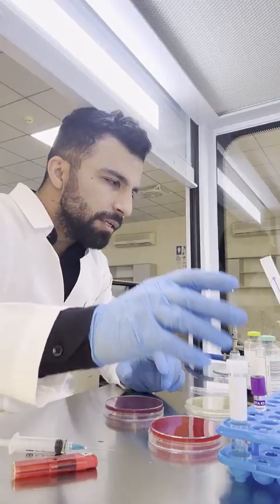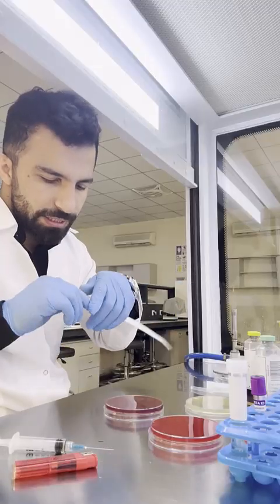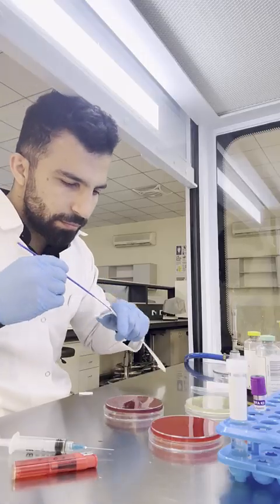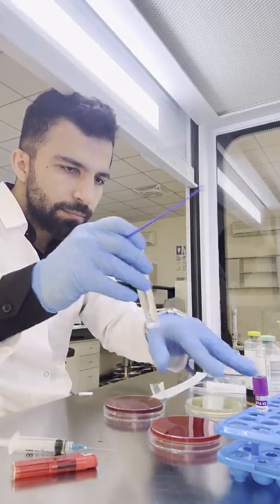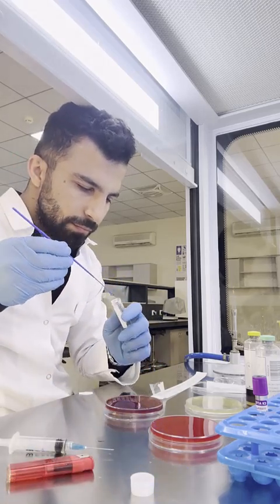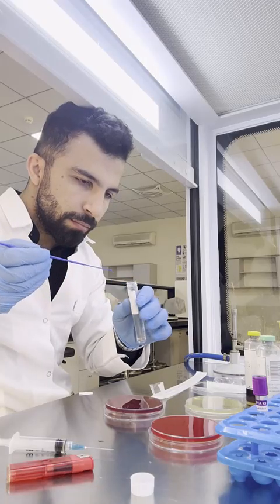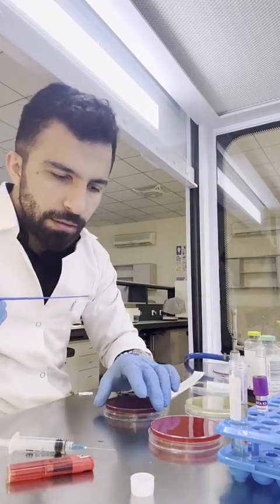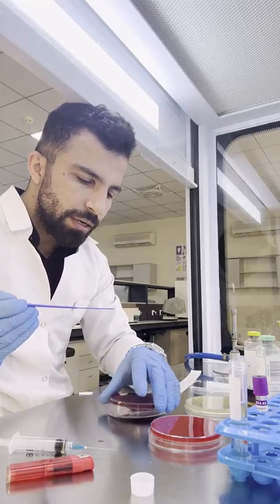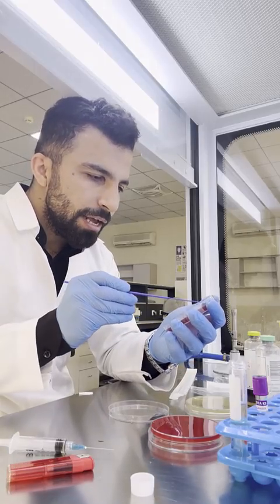The same goes for the urine sample. Urine sample is easy. We can use this kind of loop, the plastic loop. The urine culture is easier than blood culture. We're only going to put it right here and then streak it.